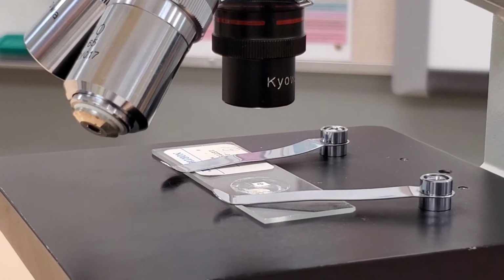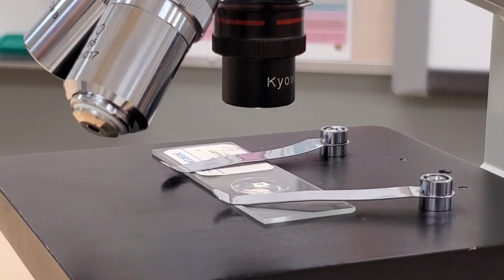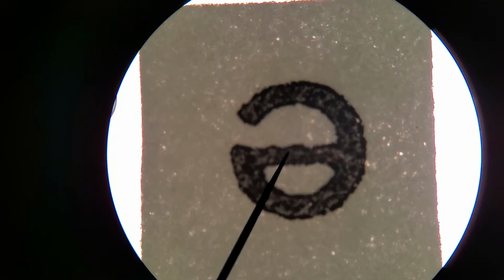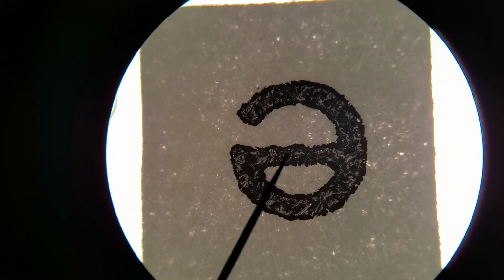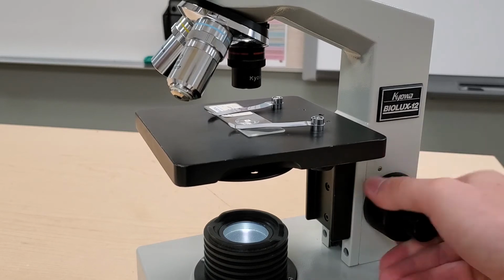It's important for you to remember that the only function of the focus knobs, the coarse focus and the fine focus, is to raise or lower the stage. If you raise the stage too high, you'll bring the slide into contact with the lens of the objective lens. This will make your teacher very sad because it's probably going to scratch one of those two things.